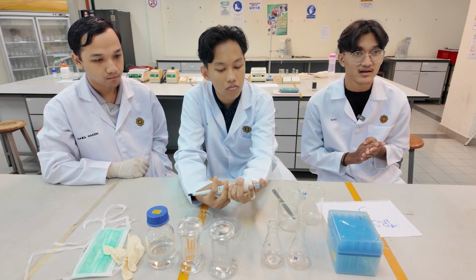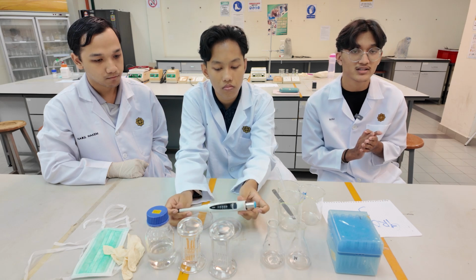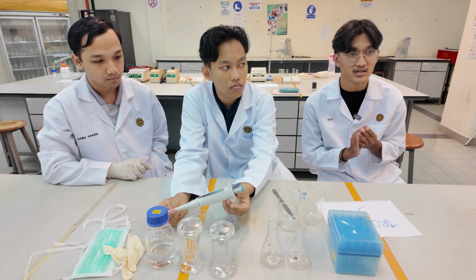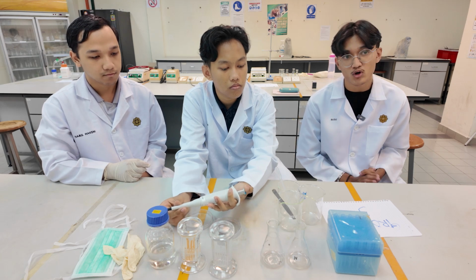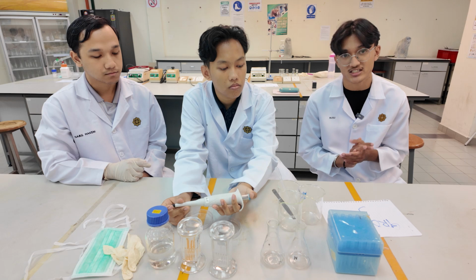Okay, and then for the next one, we use TLC also for monitoring the reaction. For example, the scientists use TLC to monitor whether the reaction is complete or not, so that they can save more time and use the right amount of ingredients needed for the production.